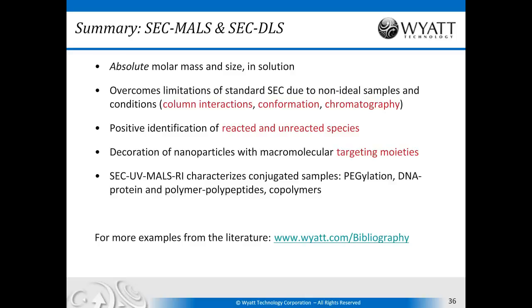Something which I haven't shown, but you can also address is decorated nanoparticles. That again would be through the conjugate analysis, and then all these other types of conjugates that you can analyze: polypeptides, DNA, protein, et cetera, et cetera.